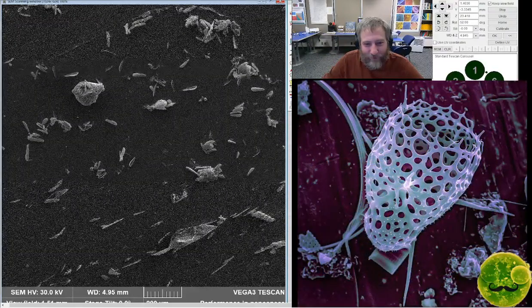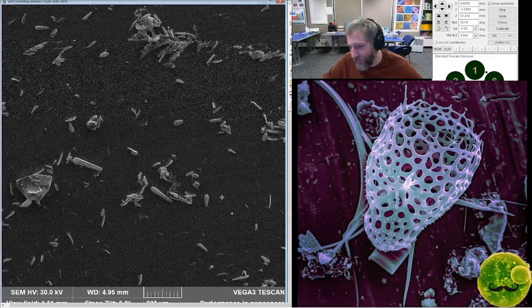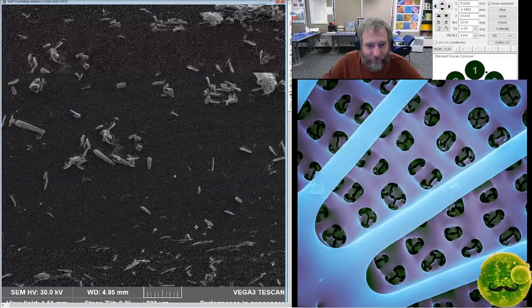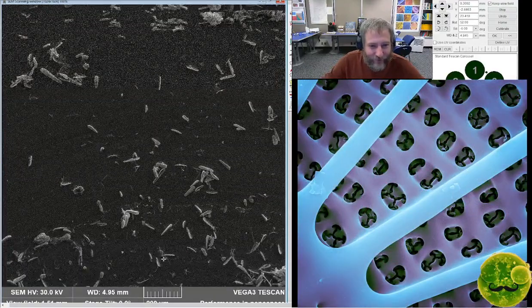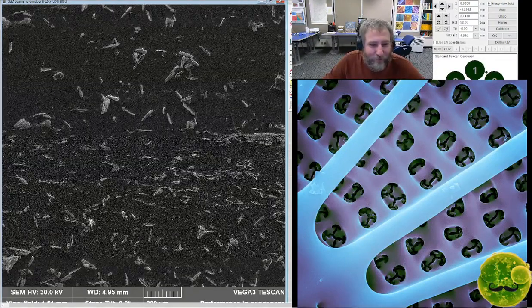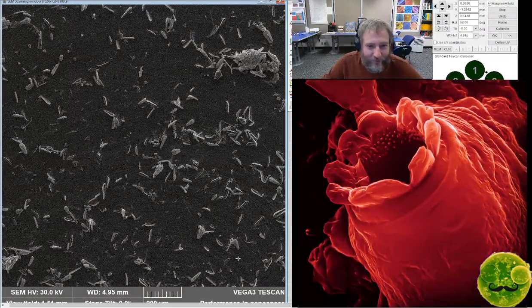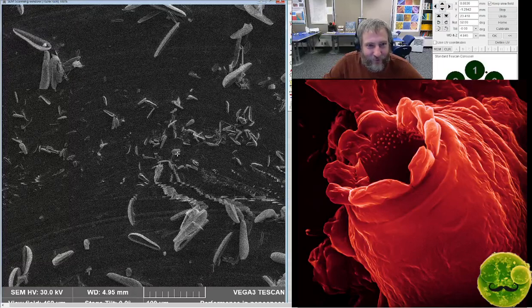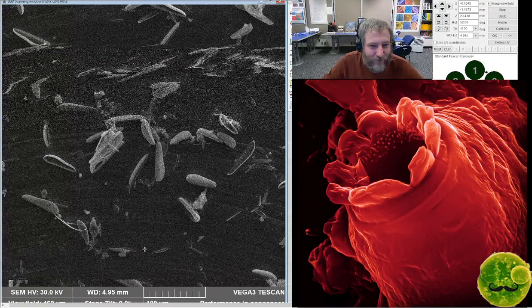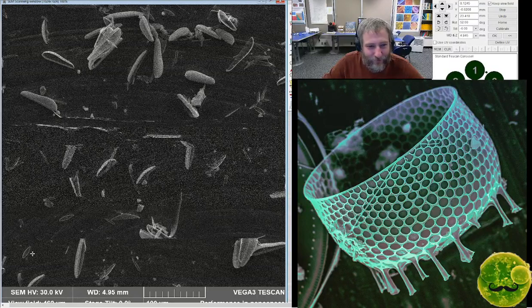All right, let's zoom around. I'm gonna hop over to, is it 3 o'clock already? I'm gonna hop over to a different stub. I feel like I've convinced myself that that thing I was looking at's not an Afrocymbella, but probably it belongs somewhere as a sister taxa to it. And my guess is that eventually Itzy and I will get around to moving it where it belongs, because it doesn't belong with a typical Gomphonema, in my opinion.